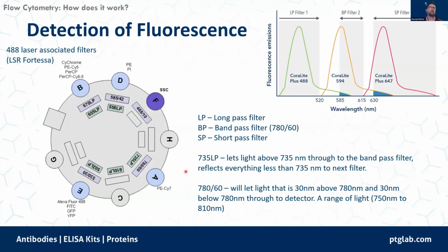So how do we filter out, within this detector associated with this one laser, light associated with particular fluorophores into their particular filters and detectors? Imagine we have some light enter here. Okay, so we have light entering, and this light contains a large spectral profile of different wavelengths.